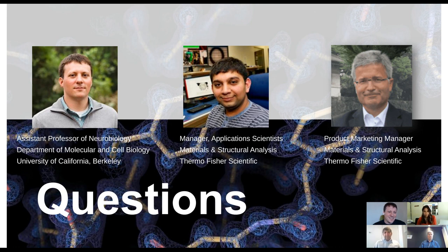Indeed, this is why we want to move everything towards nanodiscs. It was the same with GABA as well. All the GABA work that I showed, the sample was within the nanodiscs. When Radu's group tried in early days with detergents, they saw lots of differences in how this channel was behaving, because the channel is very dynamic. In most cases, the channel was found to be collapsed.